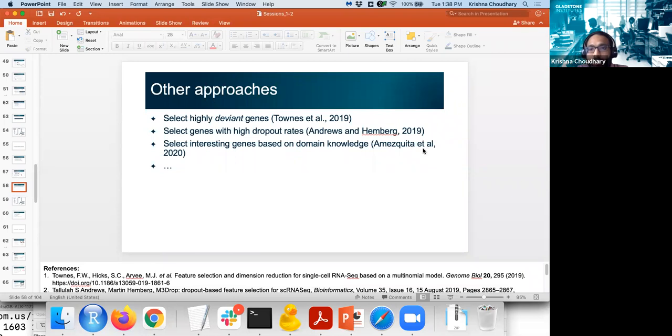So there is a question from Paul Su. Thank you for the question again. Their question is, when you run SCTransform, you do not need to do variable feature selection. Yes, that is correct.